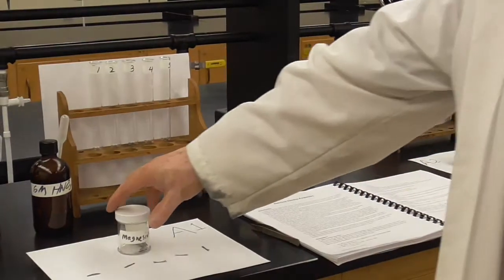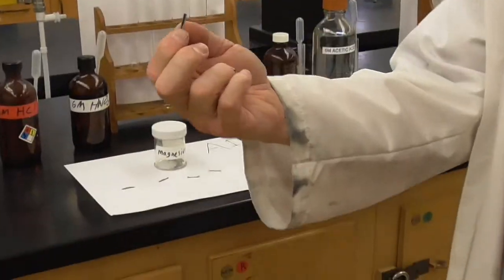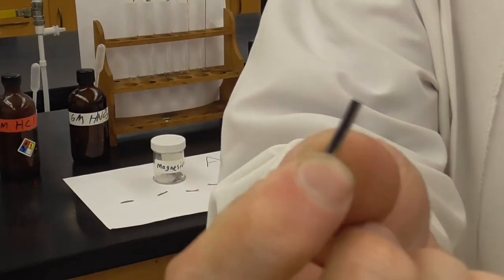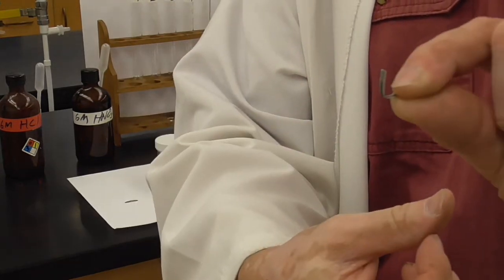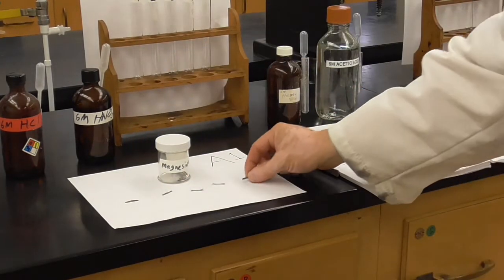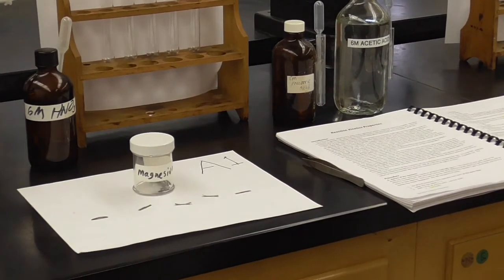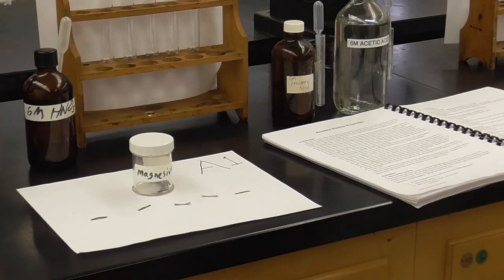We also have magnesium, and magnesium comes in these little strips. So little strip of magnesium metal. Magnesium metal is very soft. It's very flexible. I can bend it and such. But magnesium metal will react with acids, and so here we're going to investigate just which acids might react faster, just based on their nature, which acids might react slower.